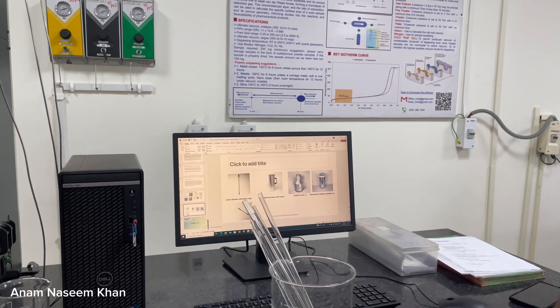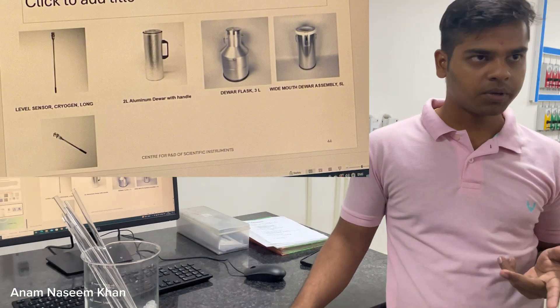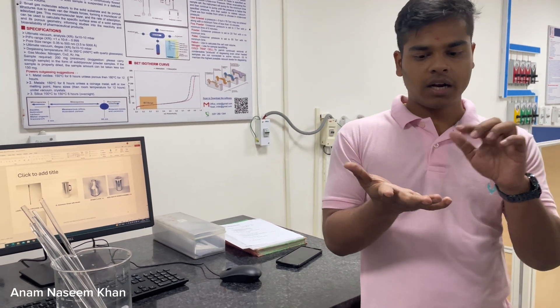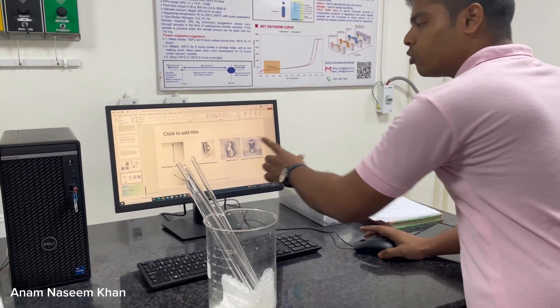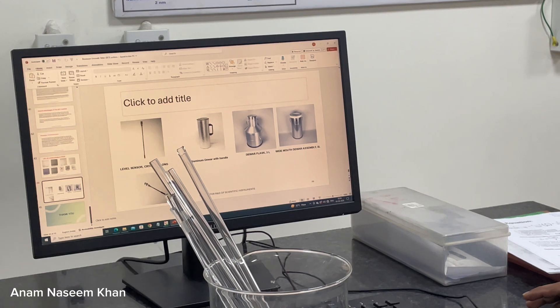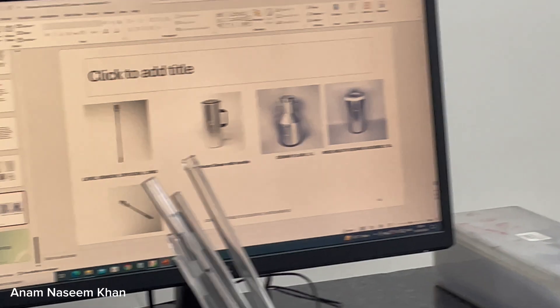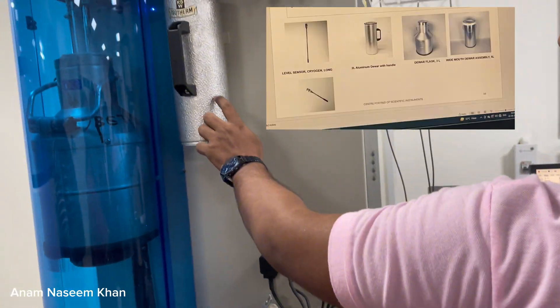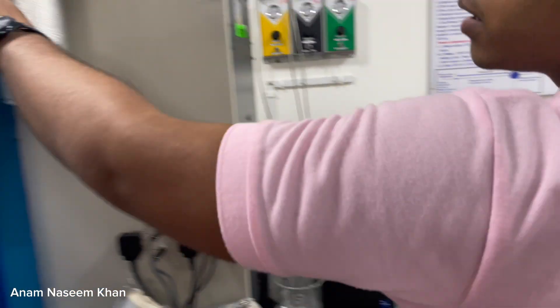Adsorption is a Van der Waals process — a weak force is working. So it can be performed at low temperature; that is why we use liquid nitrogen at 77 Kelvin. The nitrogen gas will adsorb to the sample at 77 Kelvin. This is the flux dewar, which has a capacity of holding liquid nitrogen for up to 90 hours. This is called the Polydraft flux, and this is the level sensor.